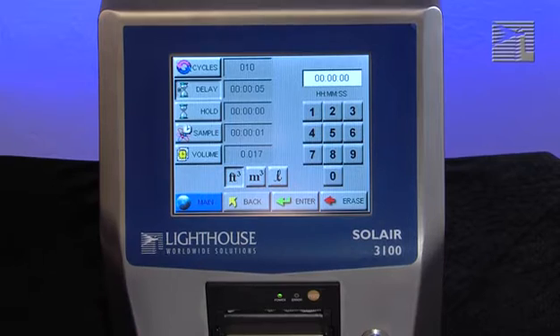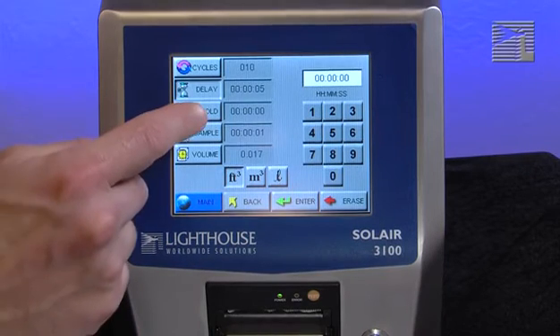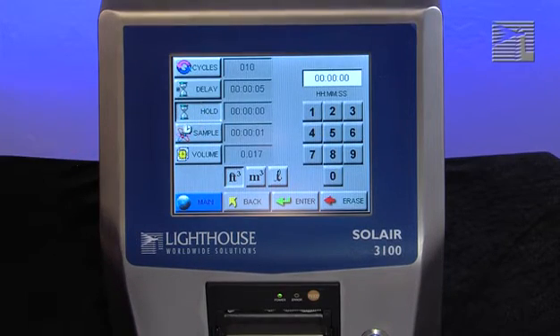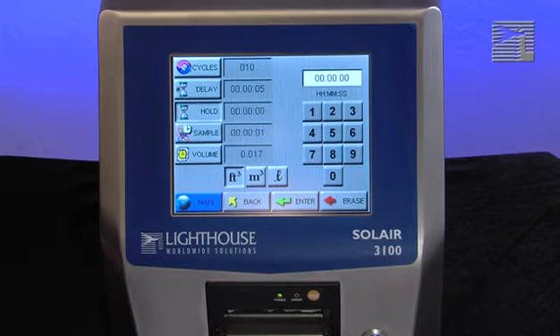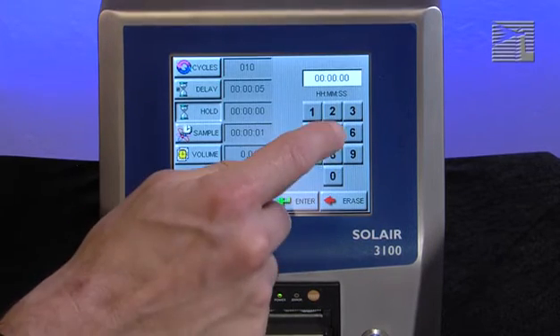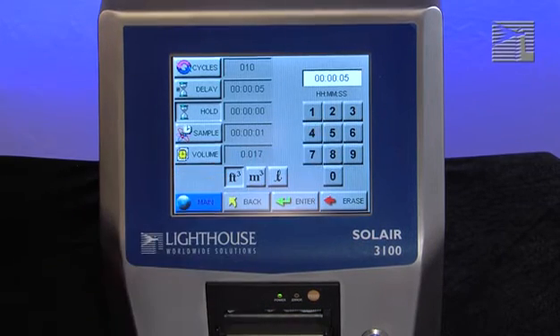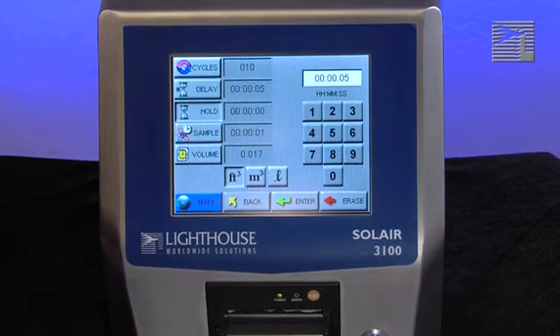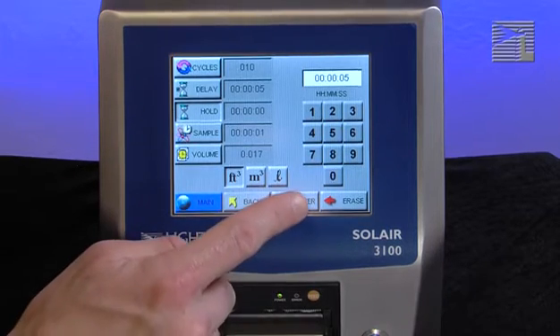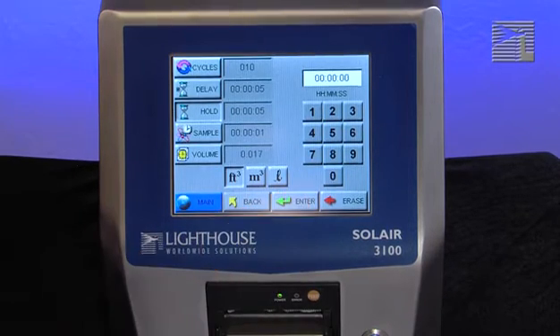The hold time is the time between count cycles when the instrument is not counting particles. Enter the hold time in hours, minutes, and seconds using the numeric keypad on the right. After the value is input, press enter.